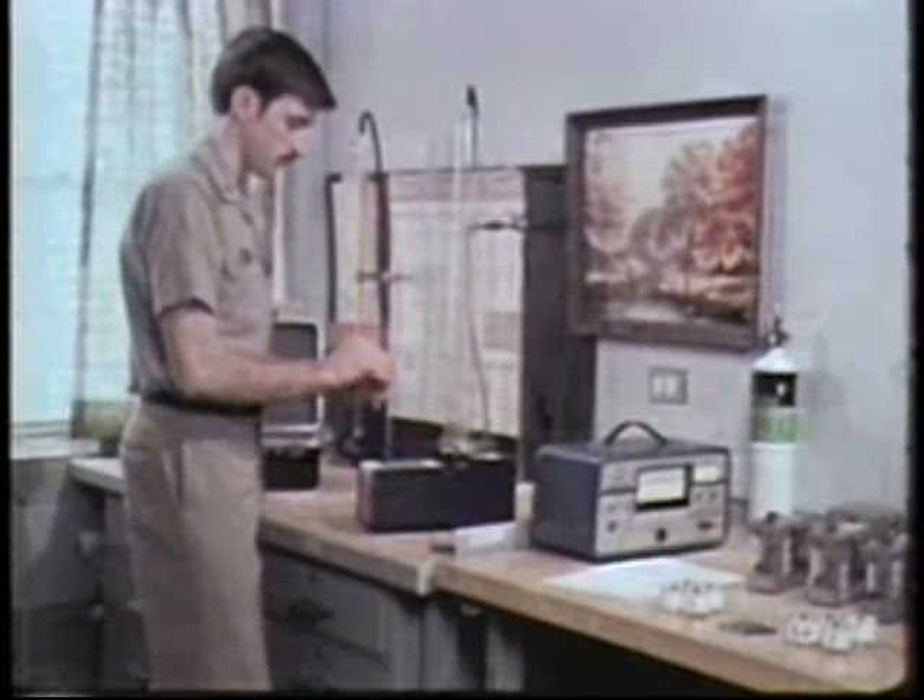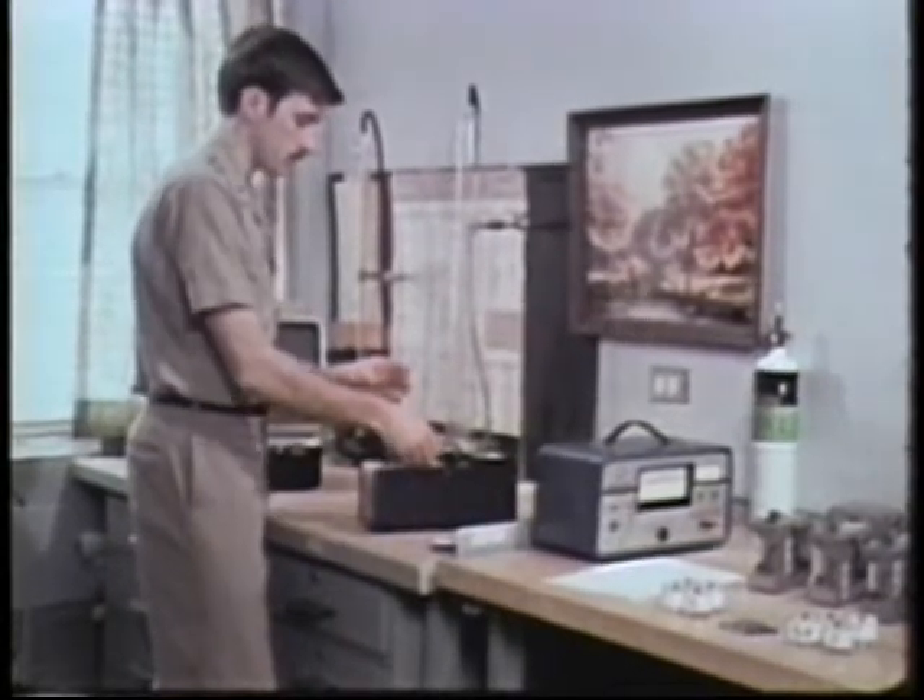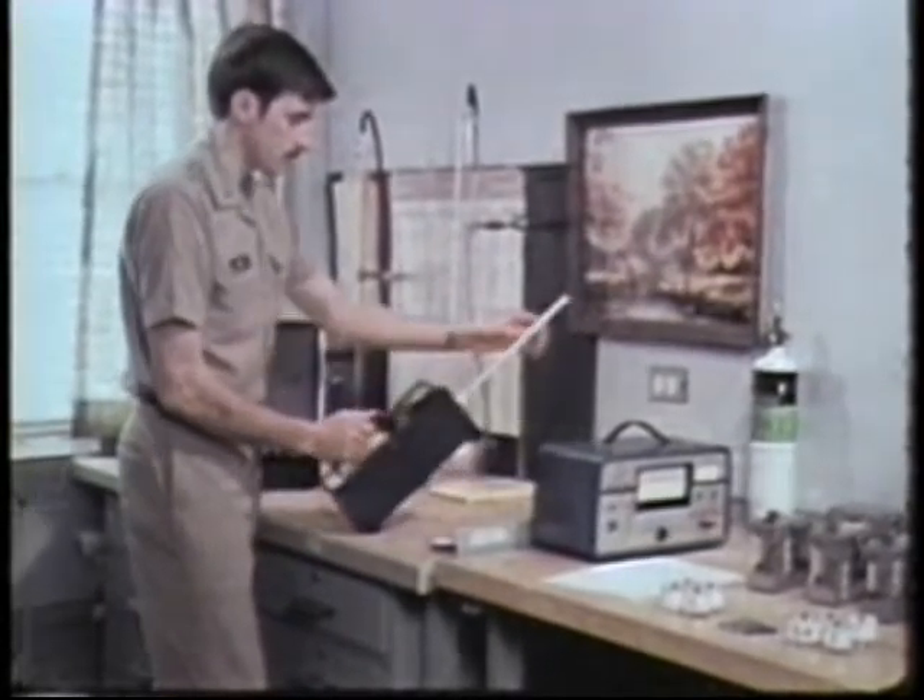It's recommended that you check the response of the instrument with a sample of mercury, if you have some available.